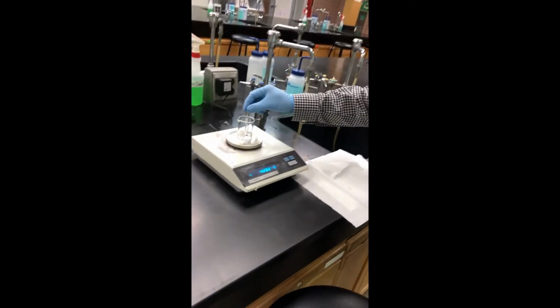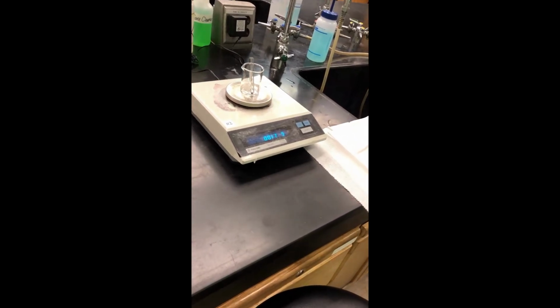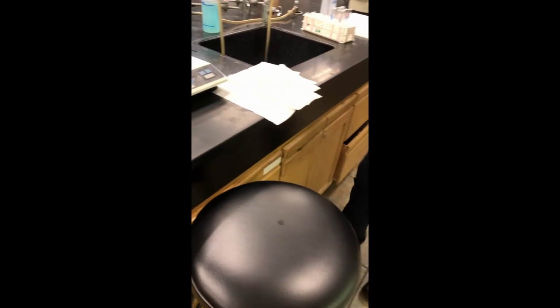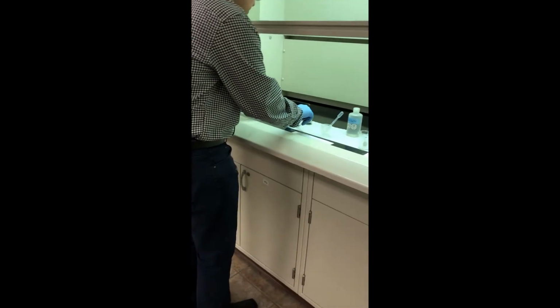I'm going to check the mass now. Here is the mass of our second test tube copper sample. Finally, for test tube number 3, we'll repeat this process.